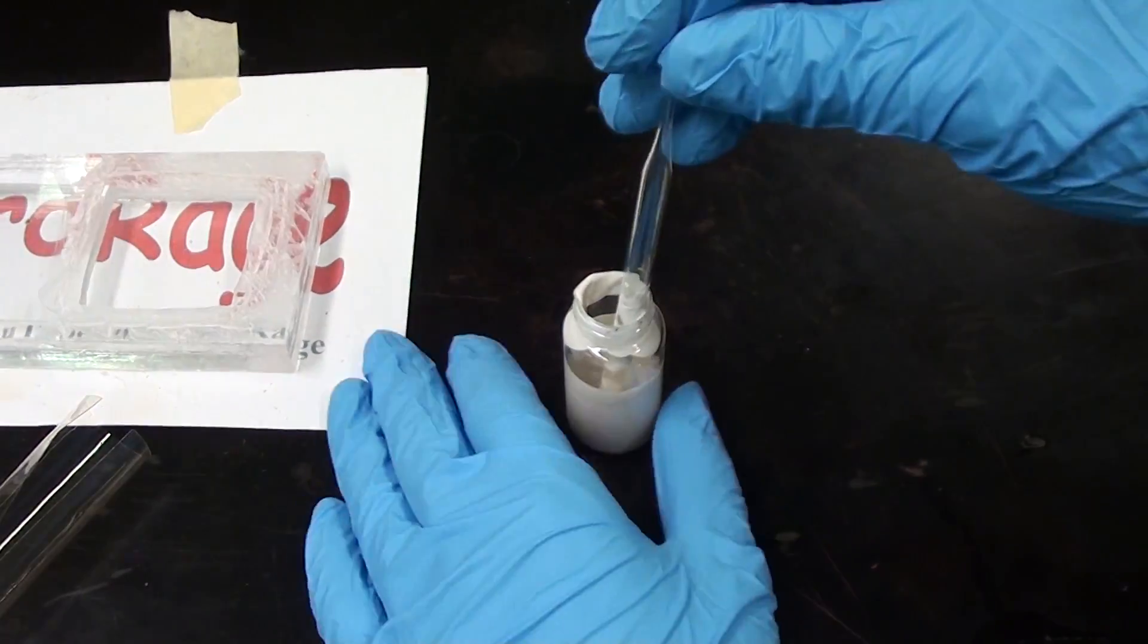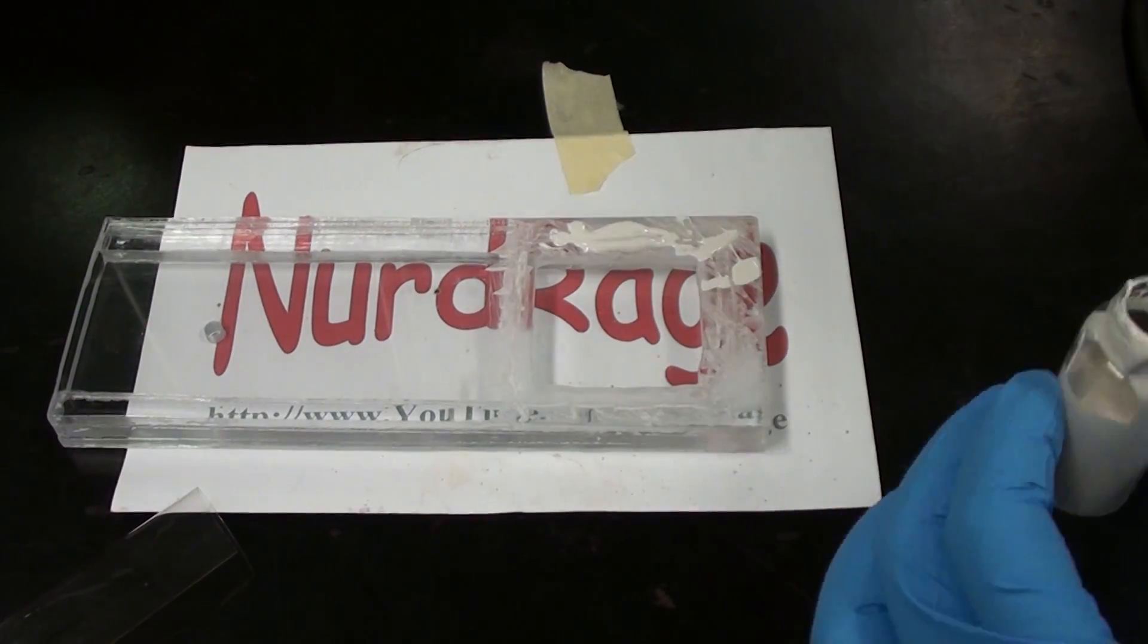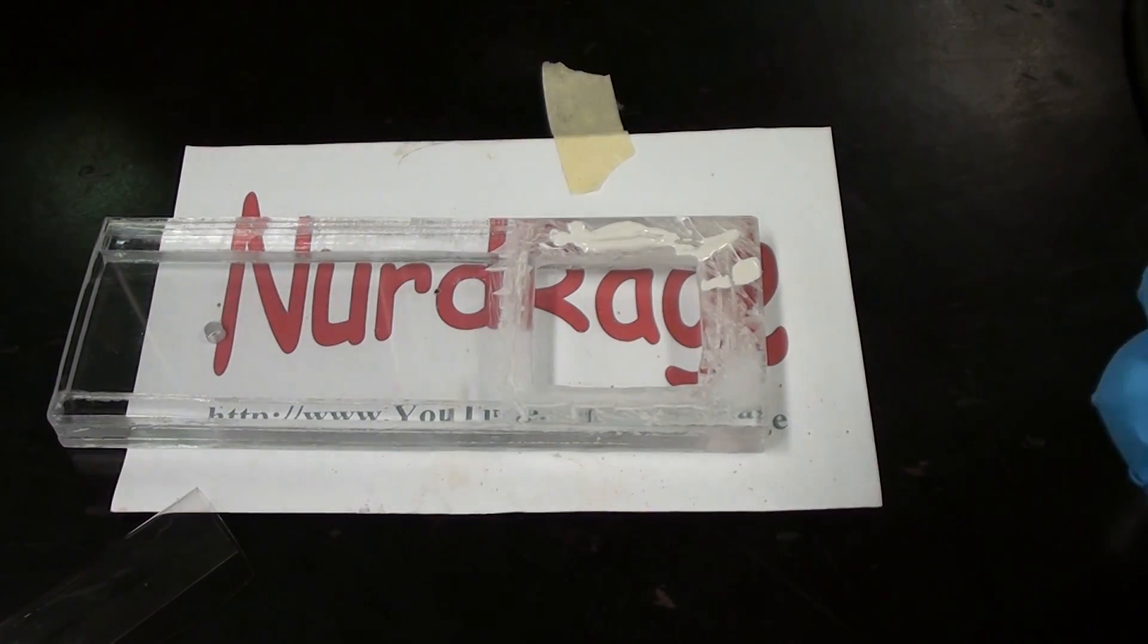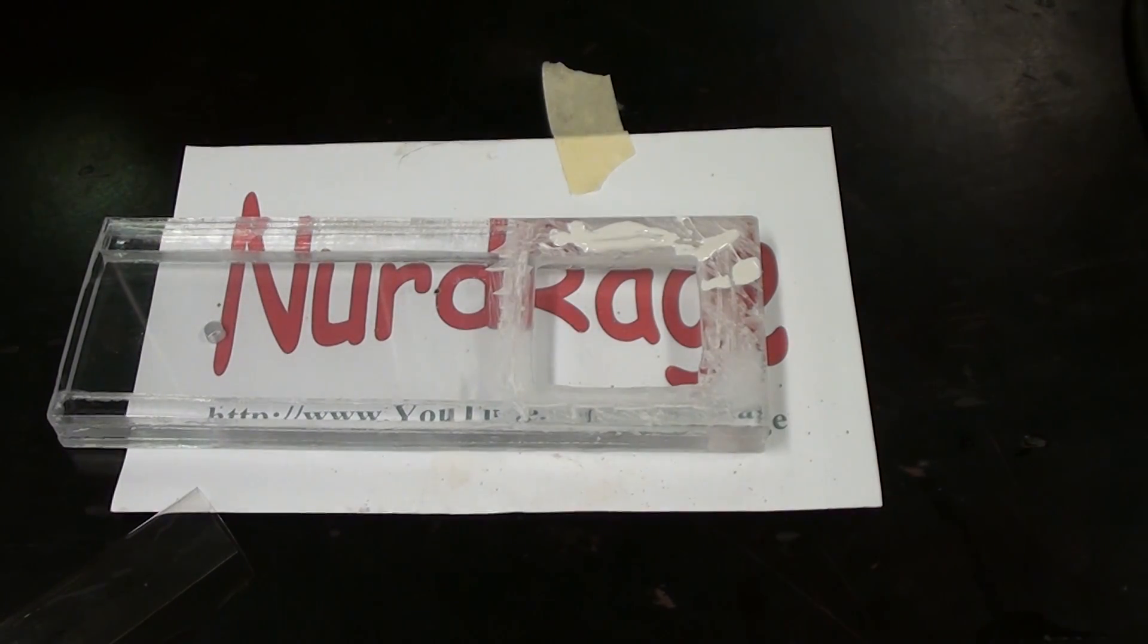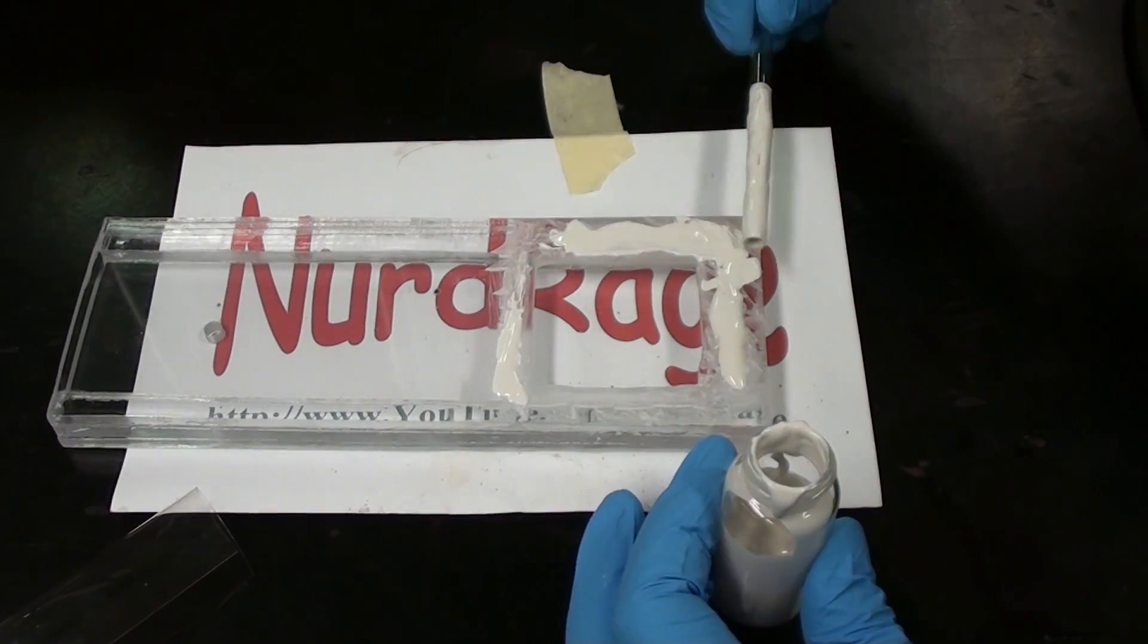I've roughened the surface with a file so the epoxy can form a stronger mechanical bond. Perfectly smooth acrylic is very hard to glue anything to. You might be wondering why I'm not using acrylic bonding solvent. Nafion doesn't bond with acrylic at all, but it does bond somewhat with epoxy. And that's why I'm using it to bridge the two.